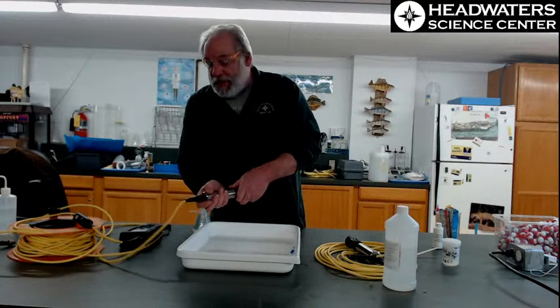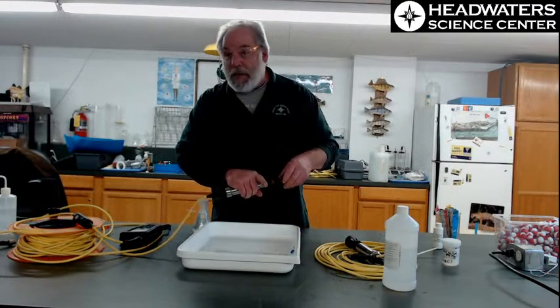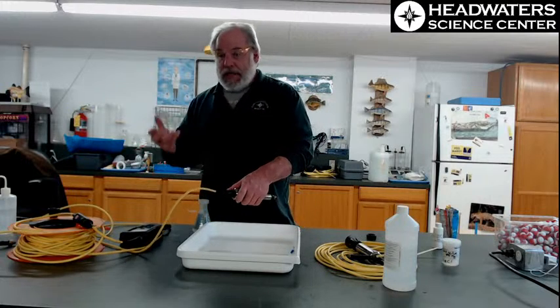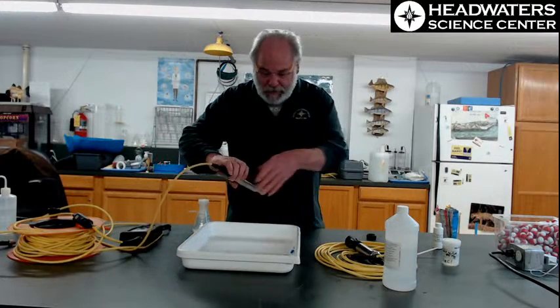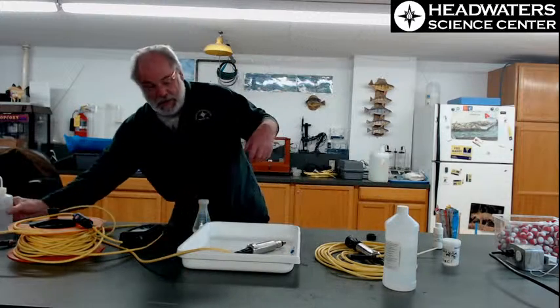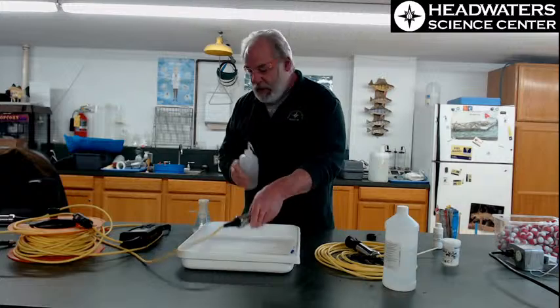Again, we're measuring in milligrams per liter, which is the same figure as parts per million. If you think about milligrams, that's 1,000, liters 1,000, 1,000 times 1,000 is 1,000,000, and that's kind of where we get to our parts per million. Remembering, of course, that the oxygen down under the water is quite low, so we have to make sure that we have a good range.